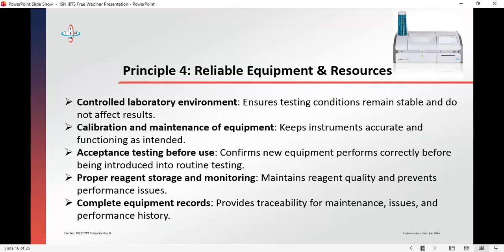You know how your phone, when the battery is draining, the light is going down. So also our instruments, over time, their ability to produce accurate results is also going down. If we do not maintain them, there will be issues with our results. We need to calibrate them, including our timers, including our pipettes.